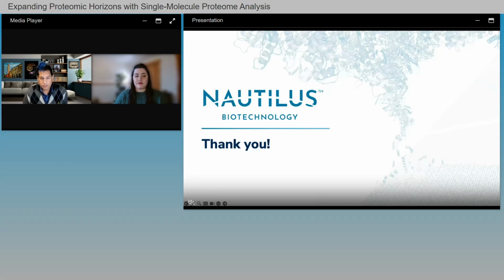Now, the reason that we chose 3 to 4 amino acids for our broad scale offering is that it turns out to be the ideal length that balances the efficiency of decoding a substantial portion of the proteome with the specificity required and the tolerance for lack of specificity.